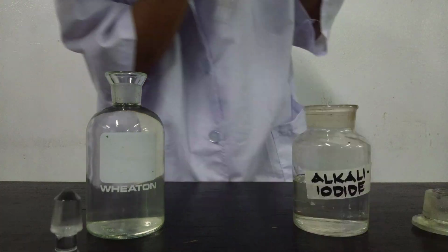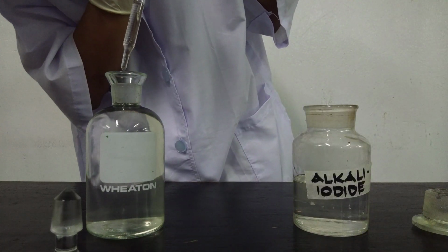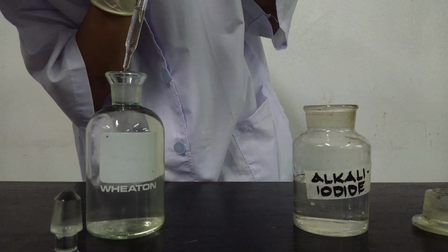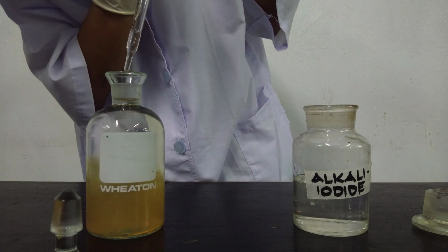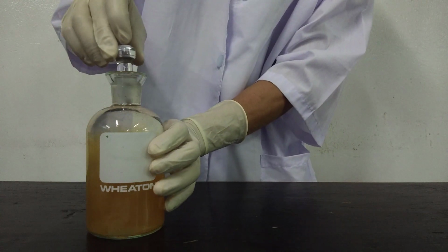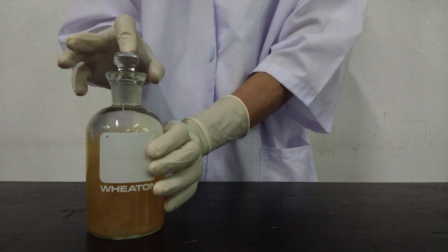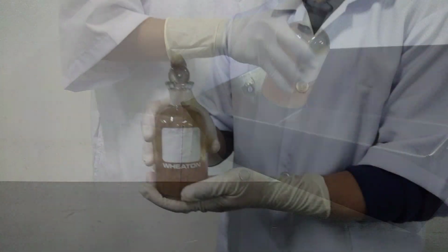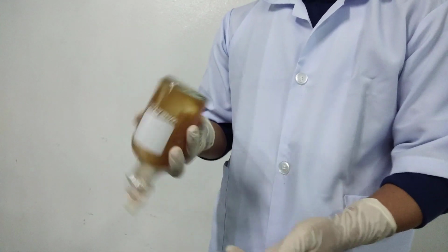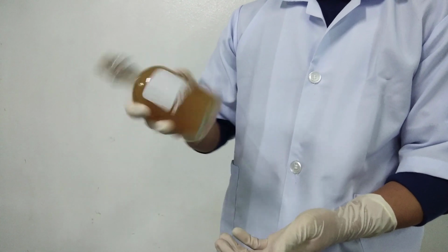After this, we will add 1 ml of alkali iodide reagent or solution, making the addition well below the surface of the liquid to avoid inclusion of air bubbles and using pipettes. We will stopper the bottles and carefully mix by inverting the bottles several times.